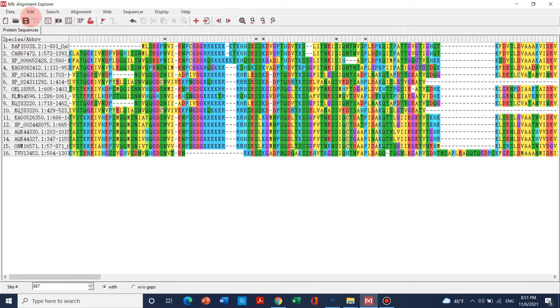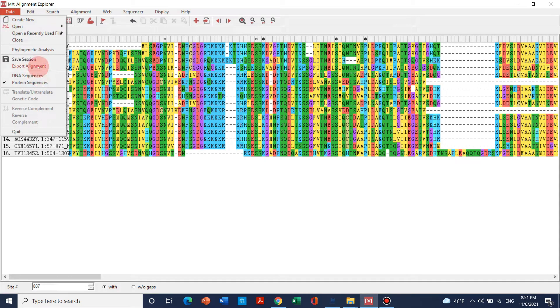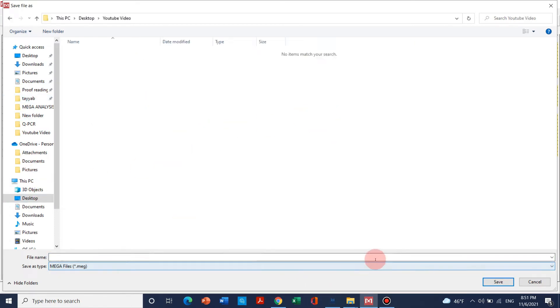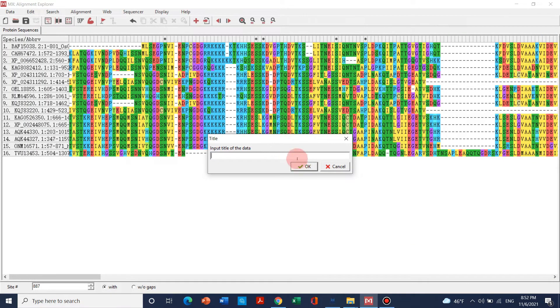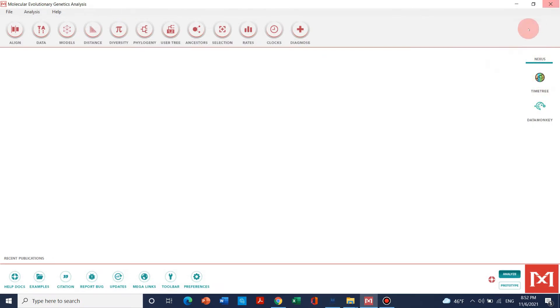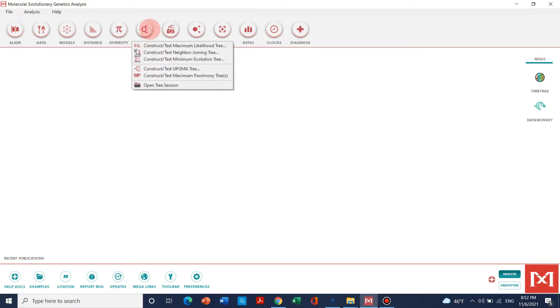Now we will save this sequence as a MEGA file before doing phylogenetic analysis. Up till now we have done the alignment. We will export this file — we can export this alignment as MEGA format. We will choose our folder 'YouTube Video' and save it as 'Task 1.' Now it has been saved, so you can finish this step.